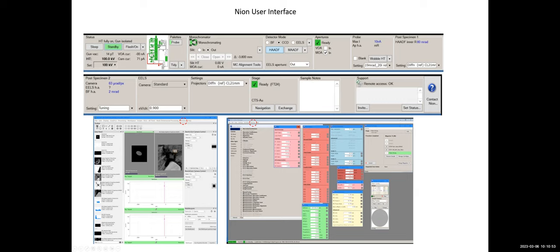And then you can see on this part something like a diagram showing different parts of the Nion microscope. You can see the green color, which means the vacuum level is at the level they expect. If they are slightly off, for example, if your sample is dirty and it's contaminating the chamber, it will first show in yellow. Yellow means warning, means the vacuum is not as expected, but it's not so bad. If it's so bad, the color will change into red.